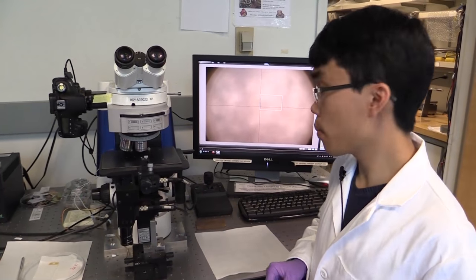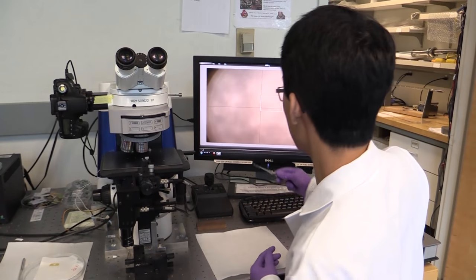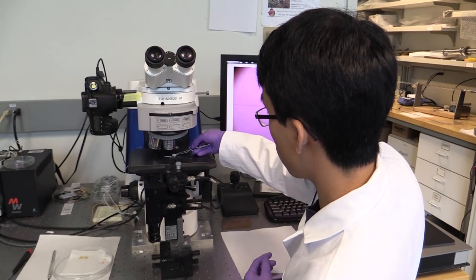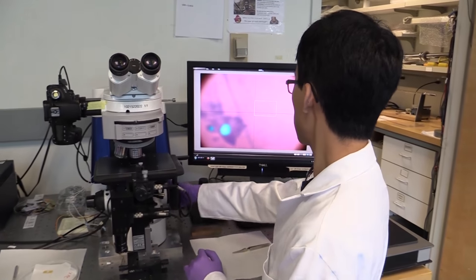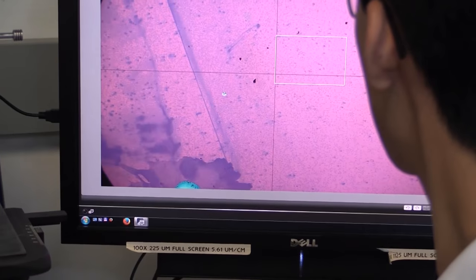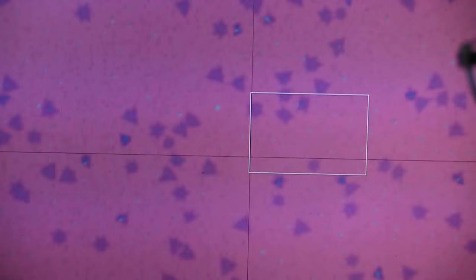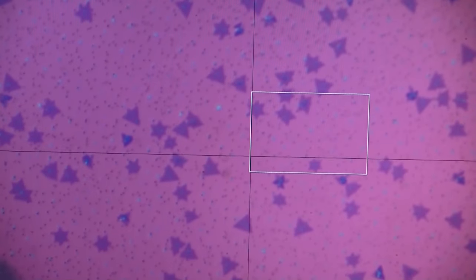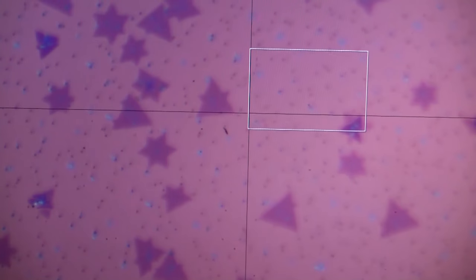Now we're just going to look at it with a high power microscope. Here we can see some non-uniformity in the crystal growth and the density. That may be due to just the heating from the heating coil. It may have been too close to the substrate. I'm going to try to find something to look at. Here we go.